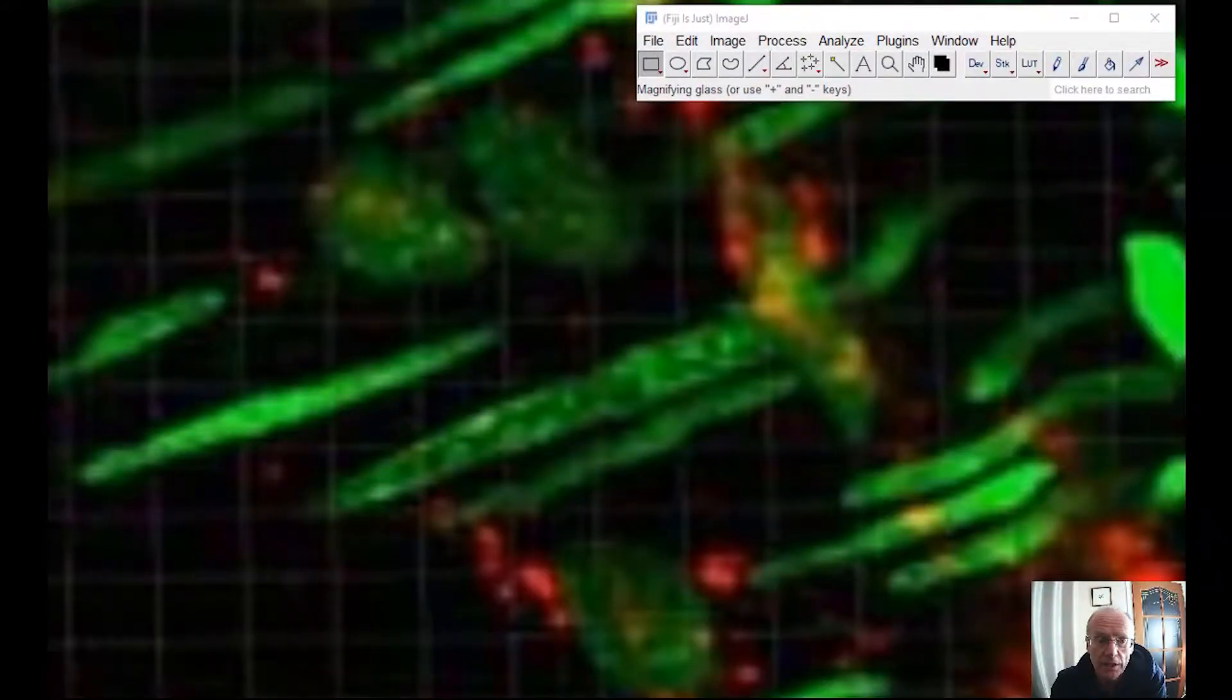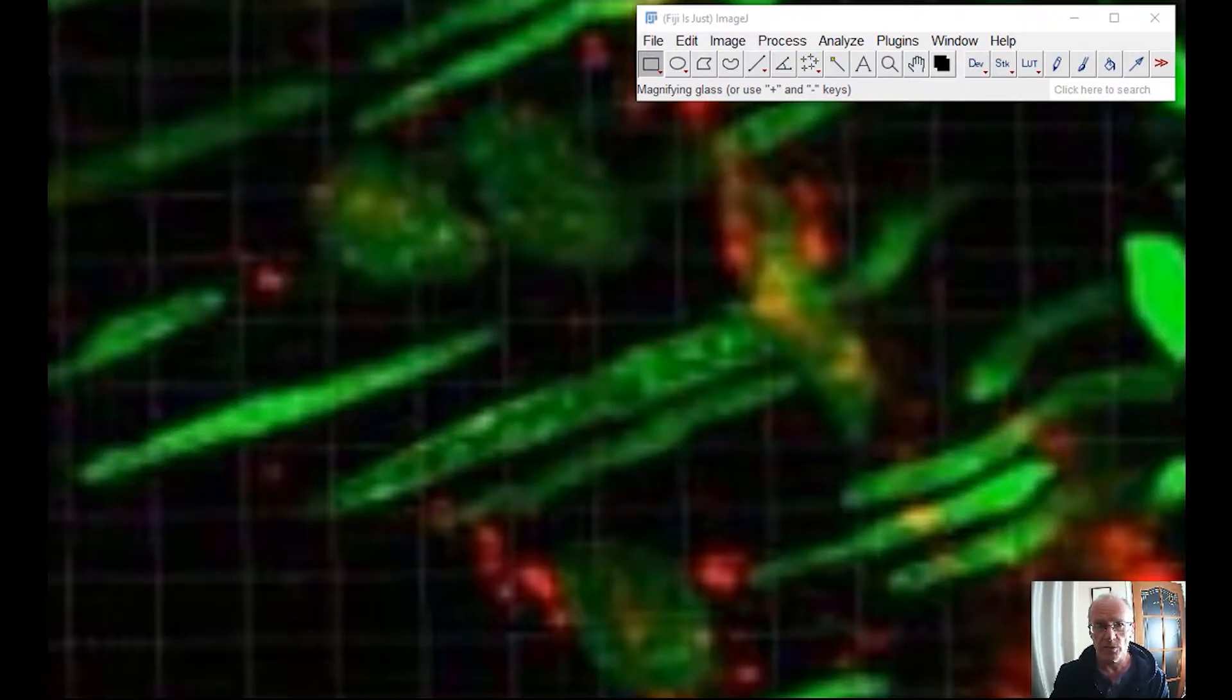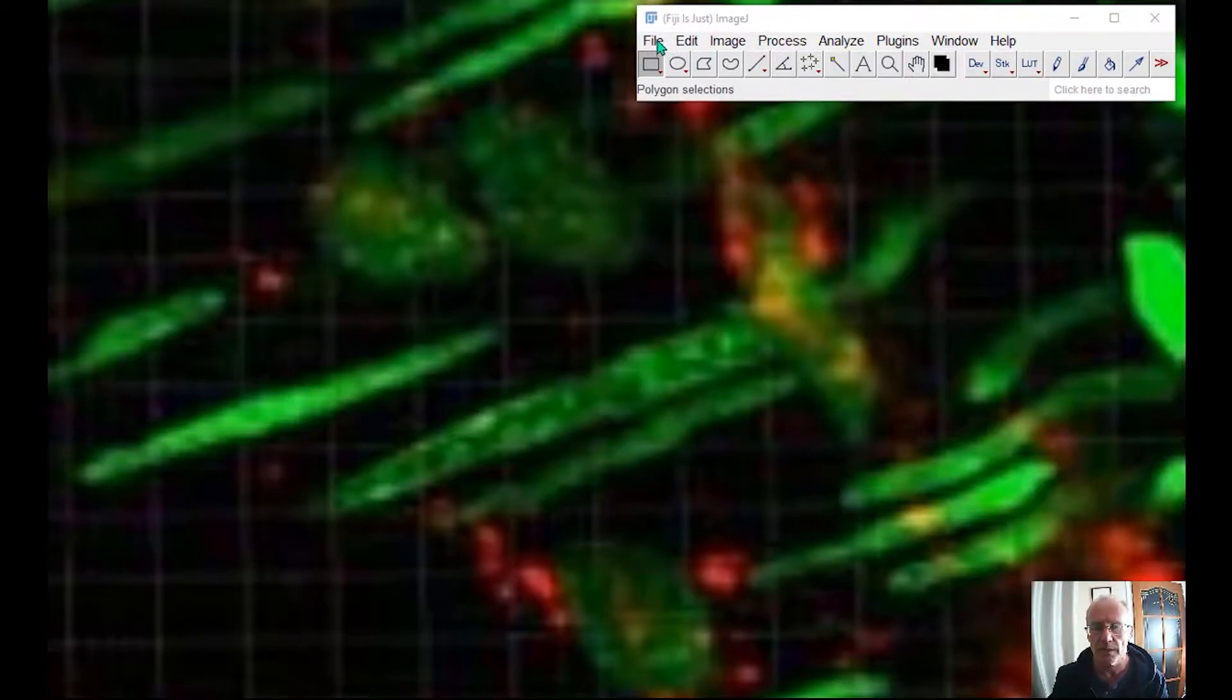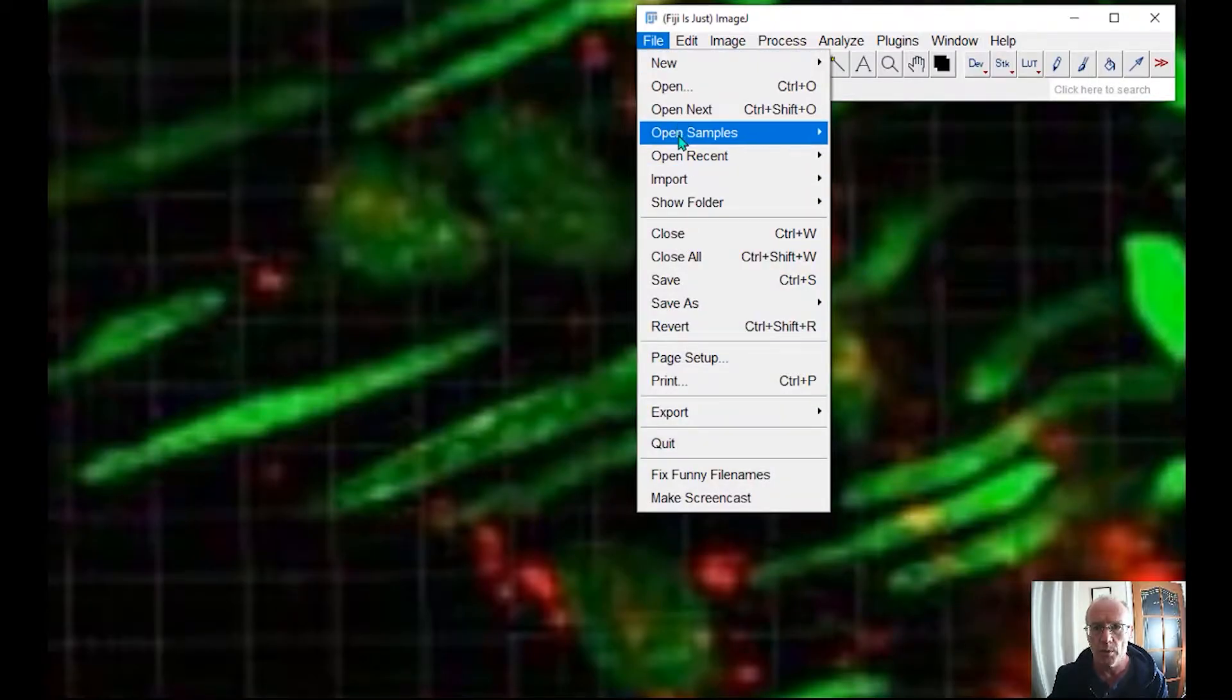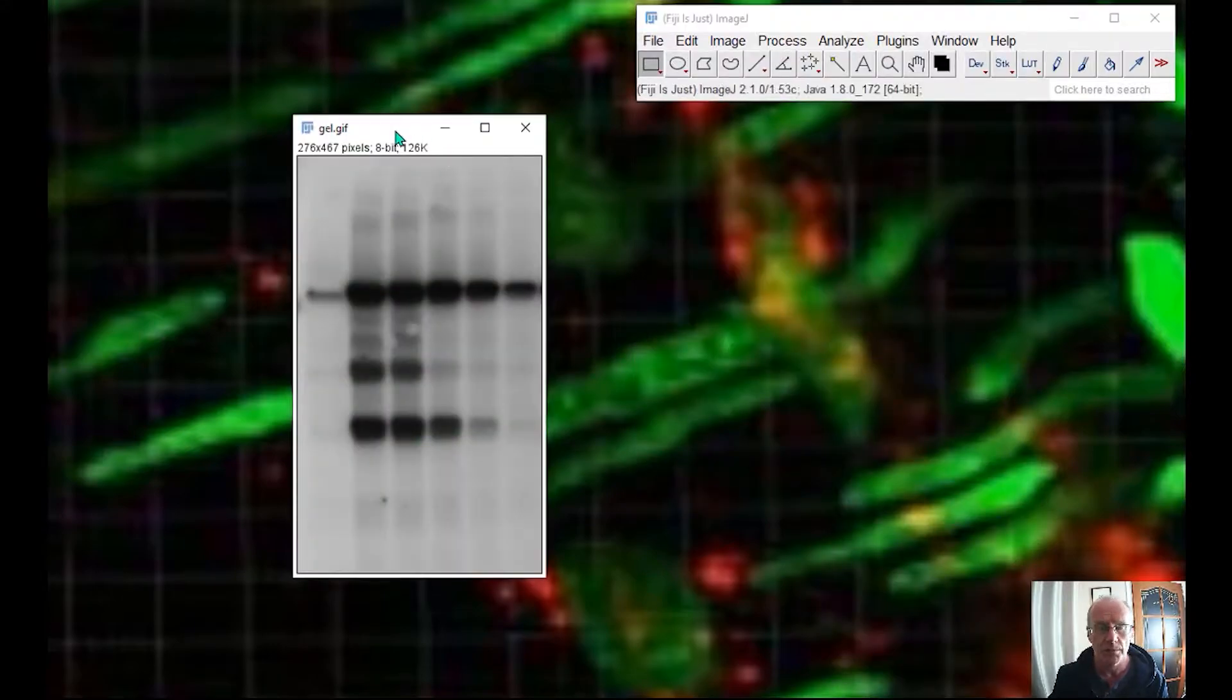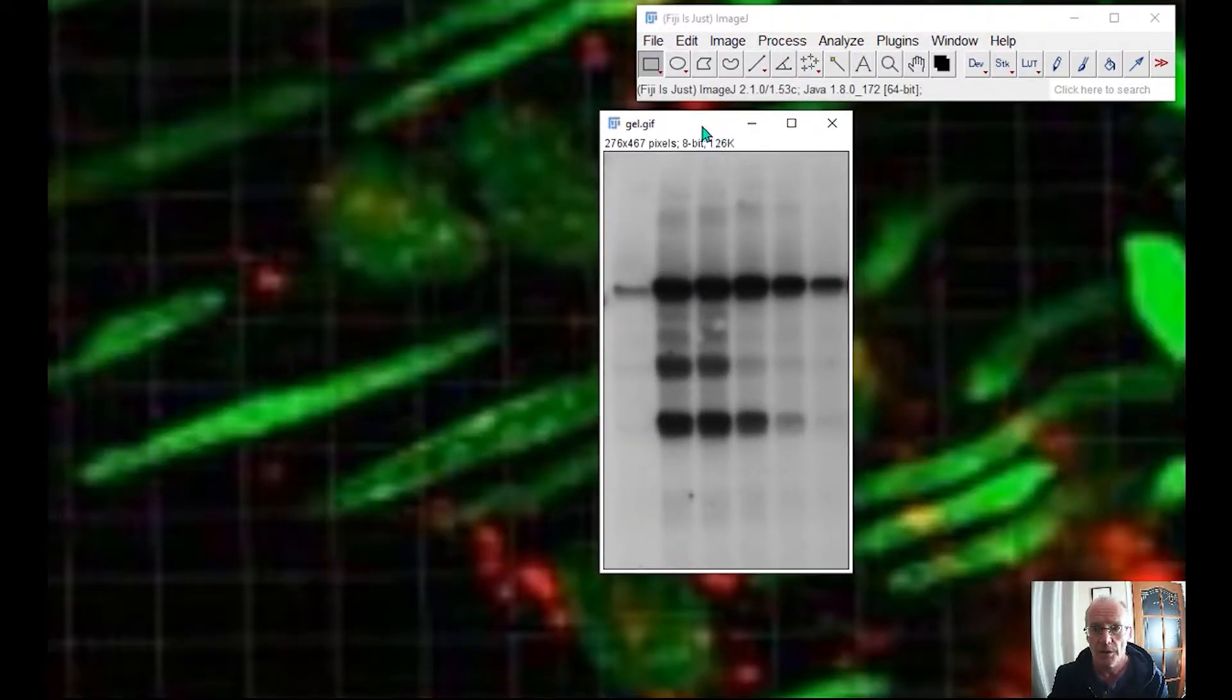So as I said in the introduction, the channel is about science chat and image analysis and image processing. And in this particular video, I'd like us to have a chat about what is the best way to analyse a gel or a blot? Because it's not something that I normally do. It's not my particular science. So let me open up the gel sample that comes with Fiji.